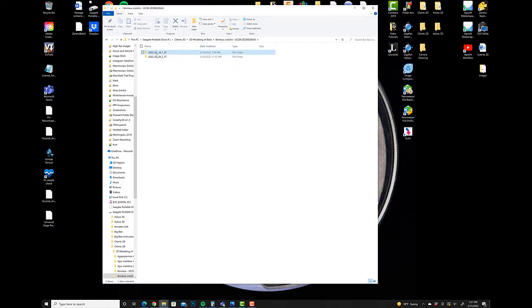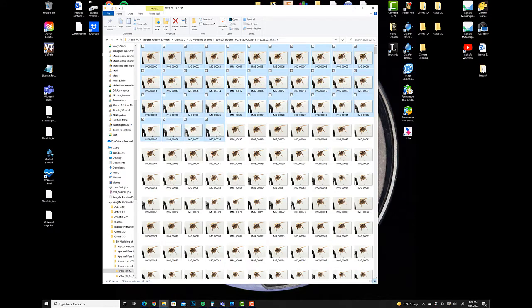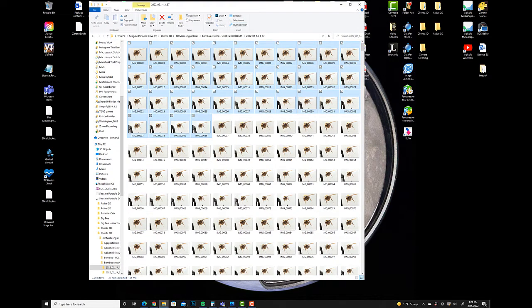If I were to go right here, click on the first one, the reason why I added the 37 behind it, this is where that number of steps is important. You'll see that if I were to select this image and go through them until the focal plane sort of resets after the specimen moved 2.5 degrees, looks like it's right here. If I were to drag those images, you'll see that's 37 total images. So that means now what we want to do, rather than manually dragging these to a whole bunch of individual folders, we want to separate these out automatically in intervals of 37.